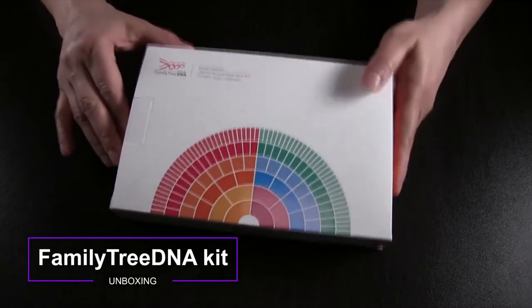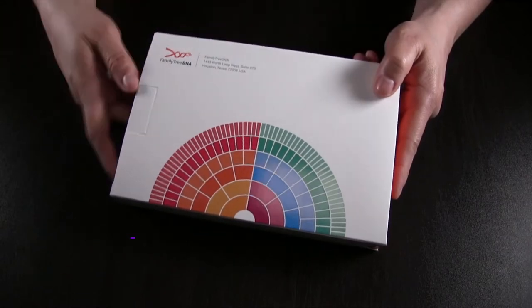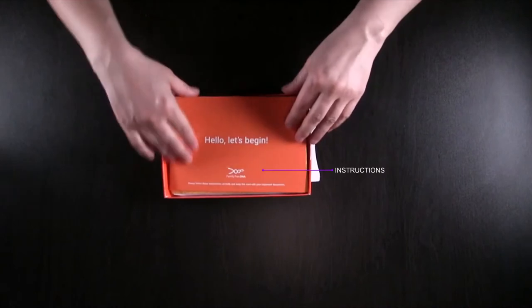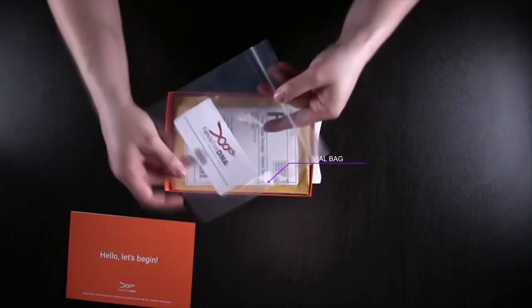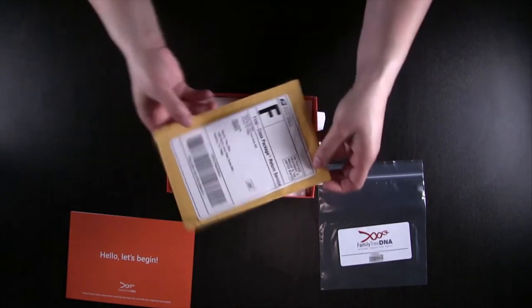I was lucky enough to get a box from Family Tree DNA. This is where they're at, so let's open it up. This one right here is the instructions, and you'll also have a vial bag, and it has your kit number on it. And this one is just a self-addressed envelope.